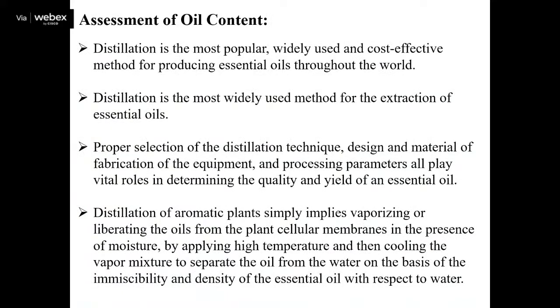So how can we get the oil? The subject is the testing and quality control of oil, but I want to show you how we get the oil from the sandalwood. Distillation is the most popular, widely used and cost-effective method for its production.